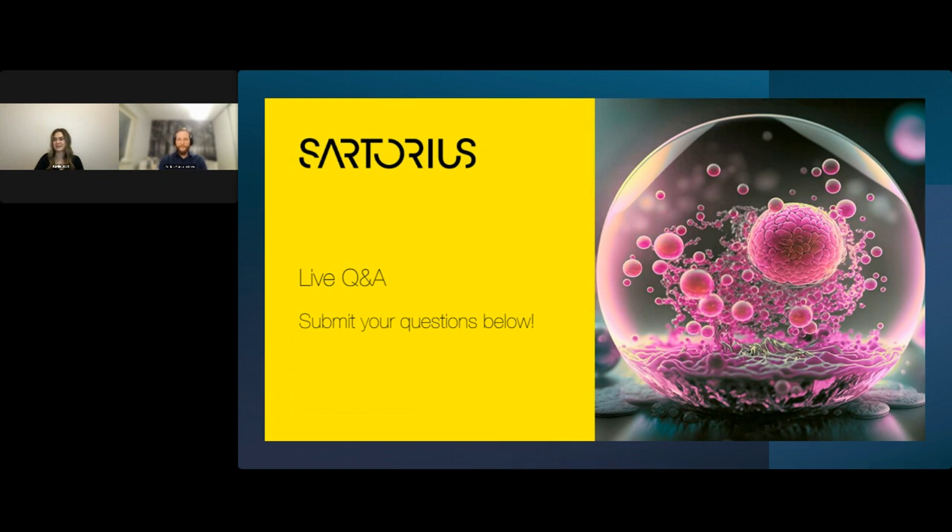This next question that we have here: from what kind of biomatrices can organoids be isolated? So here we can isolate organoids from almost any type of biomatrix, as long as we have some transparency and we can see that there's no interference between imaging and the actual selection of the organoids themselves. So here we're talking about Matrigel, hydrogel, low concentration collagen, for example, etc.